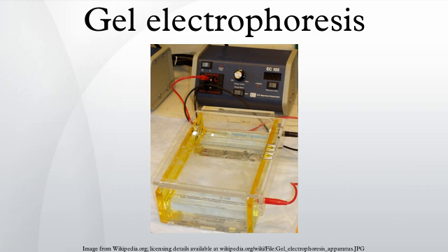Care must be used when creating this type of gel, as acrylamide is a potent neurotoxin in its liquid and powdered forms. Traditional DNA sequencing techniques such as Maxam-Gilbert or Sanger methods used polyacrylamide gels to separate DNA fragments differing by a single base pair in length so the sequence could be read. Most modern DNA separation methods now use agarose gels, except for particularly small DNA fragments.